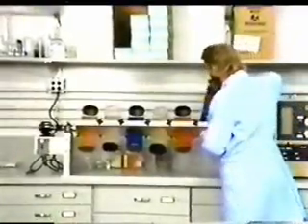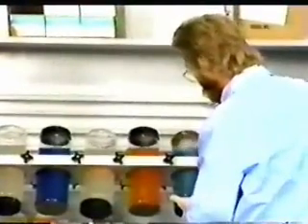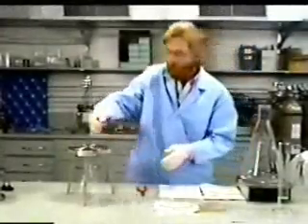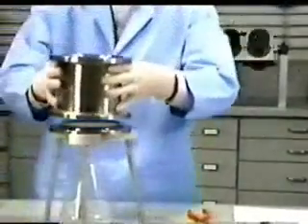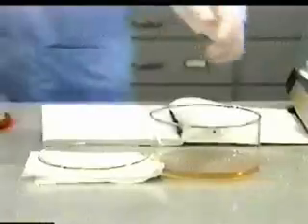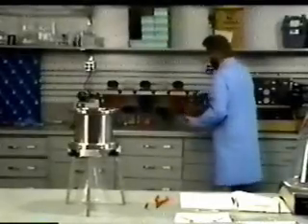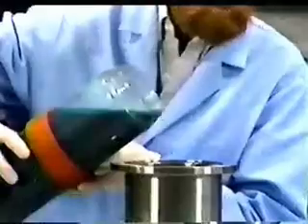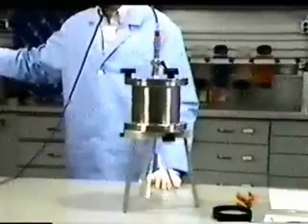As in the original method, the bottle is then placed into a rotary extractor and allowed to agitate for 18 hours. Following the 18-hour extraction, the original steel filter is placed into the filtration device. The liquid used to store the filter is added to the filtration device along with the extracted solids and extraction fluid. The extract is then filtered and analyzed as in the existing method 1311.